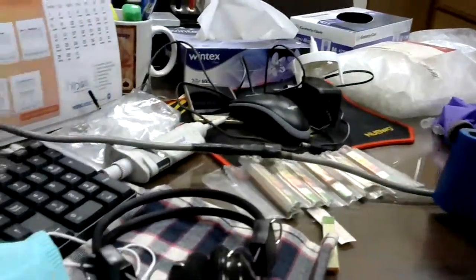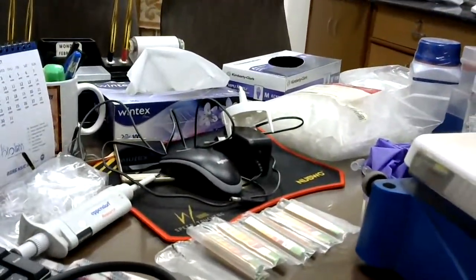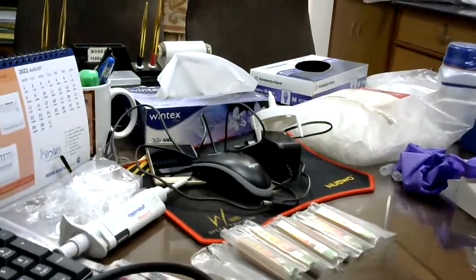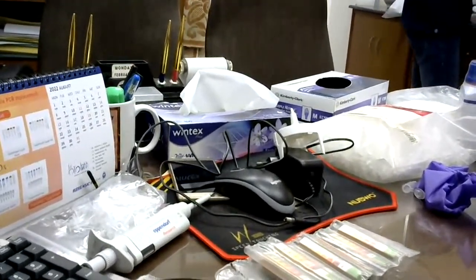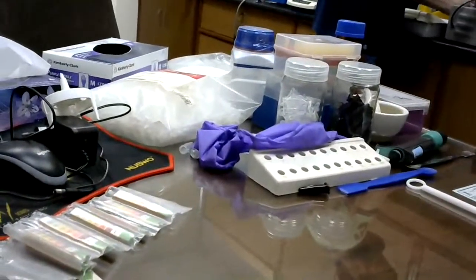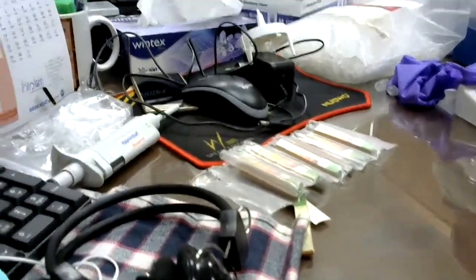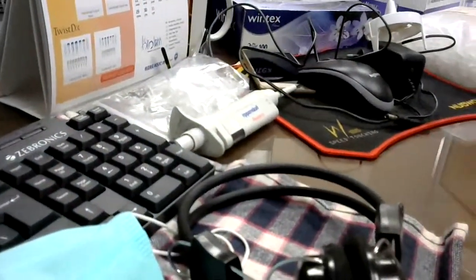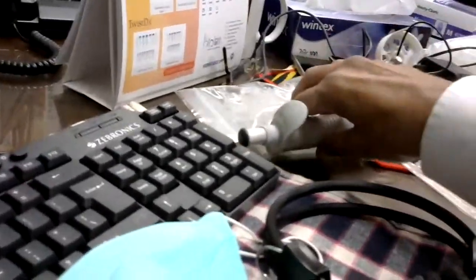Take this also. Vortex mixer. Sometimes we need to mix the solution.